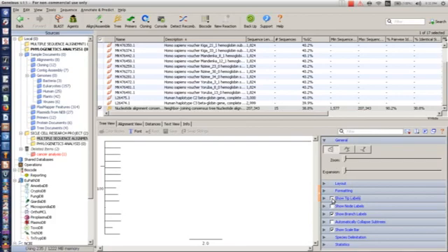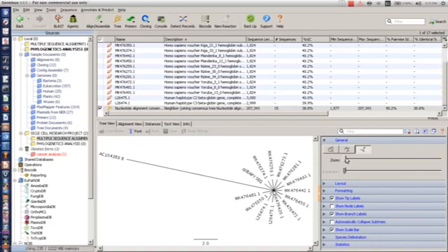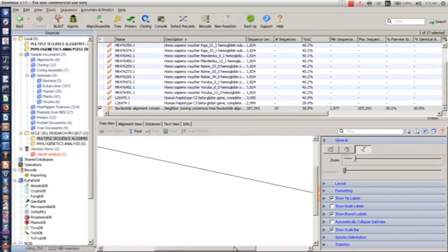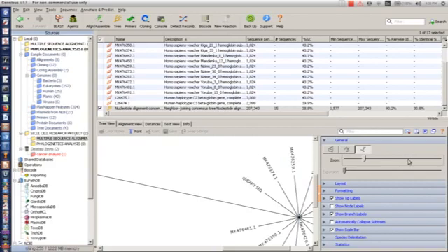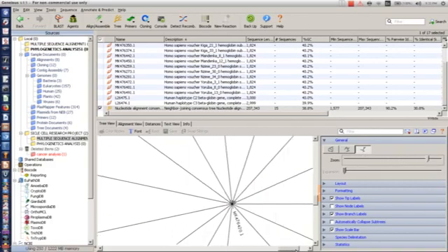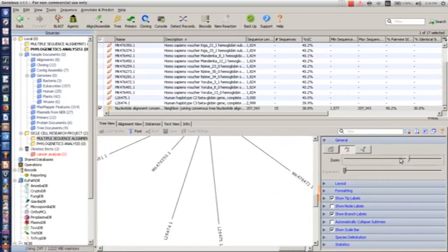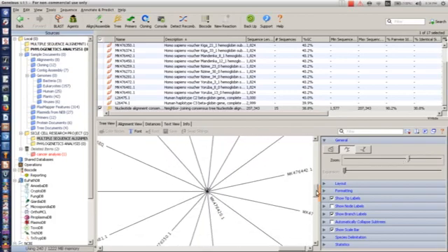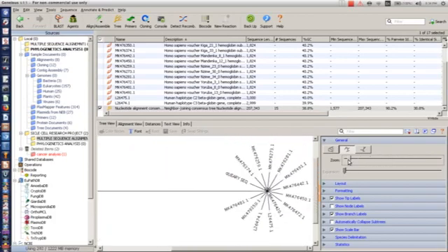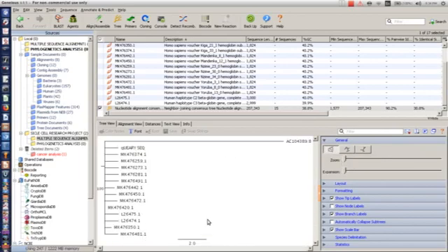So you can actually choose to do some editing, which is time-consuming. You can go through this. Now we have different formats of tree. You can choose this, so you can expand, try to really expand. As you keep on, you keep having something like this. You can even use this, which is actually showing us this. So it depends on whatever form of phylogenetic tree you want to use. It depends on you.